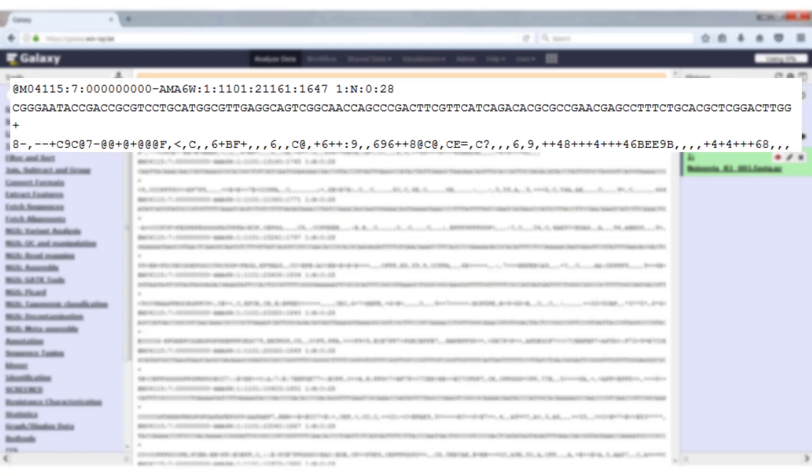The FASTQ file consists of a number of records of four lines each. As an example we will look at the first four lines of the file that is displayed here.